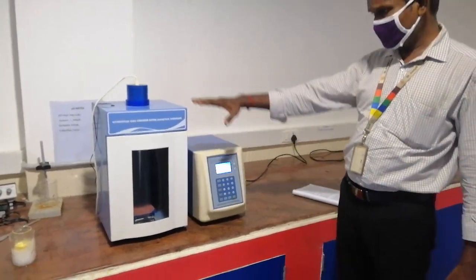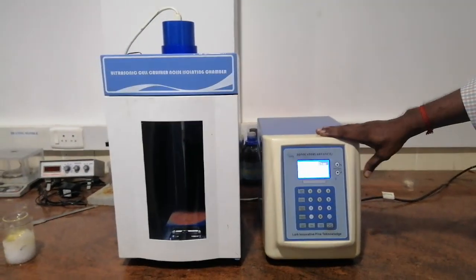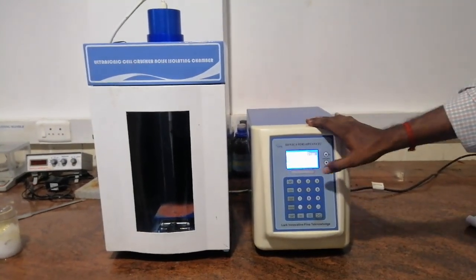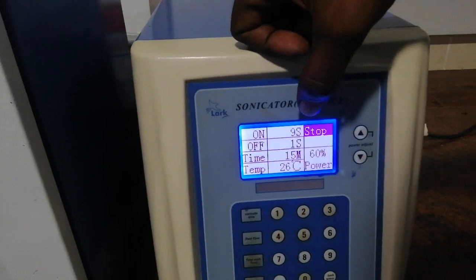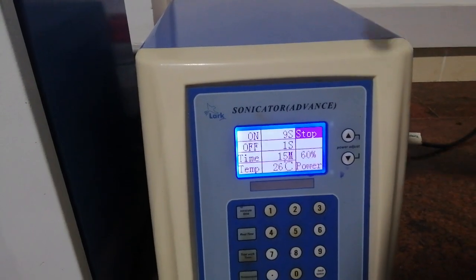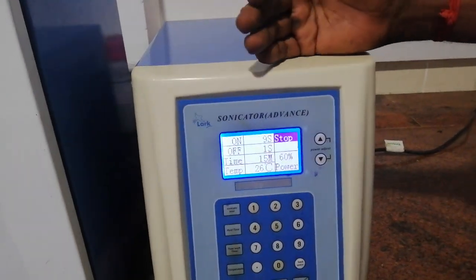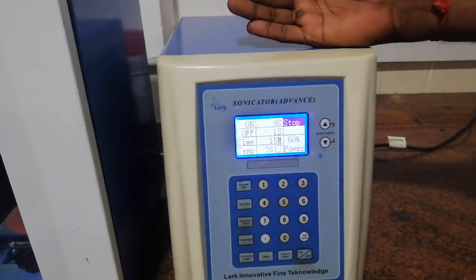So first, this is the ultrasonicator setup. This is the control panel, where we have the display, where we can fix the on time, say 9 seconds, and off time 1 second. We have kept the minimal time, the lowest time, to avoid the denaturation of your bioproducts due to the increase in temperature.